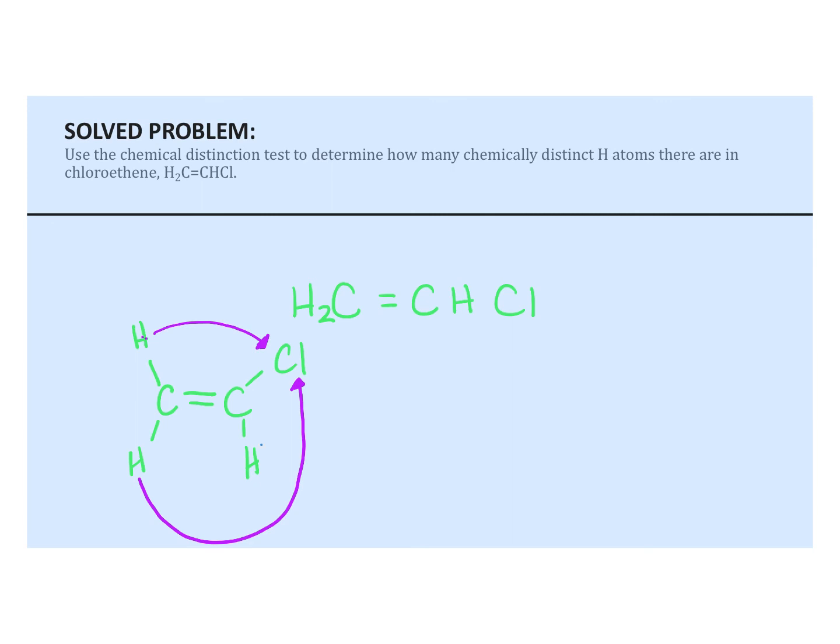And then, of course, this one has a different distance as well. So double bonds are really the only time you're going to experience this. And you're not going to see it with every double bond. You're really just going to see it when you're close to something that's very electronegative, like this example. And so this would be one of those exceptions where you do get 3 signals, okay?